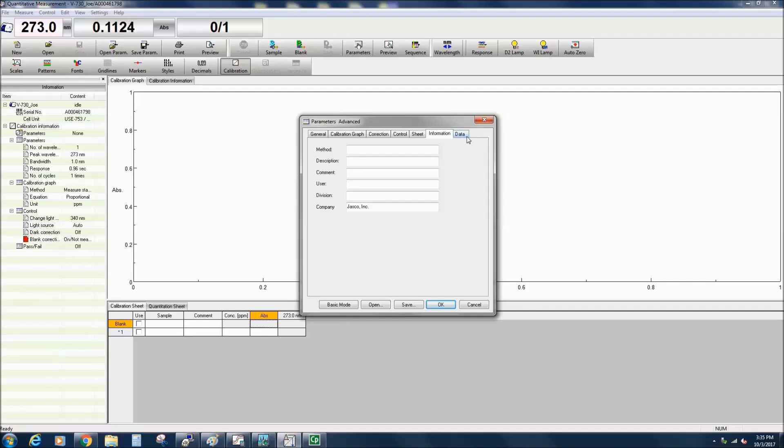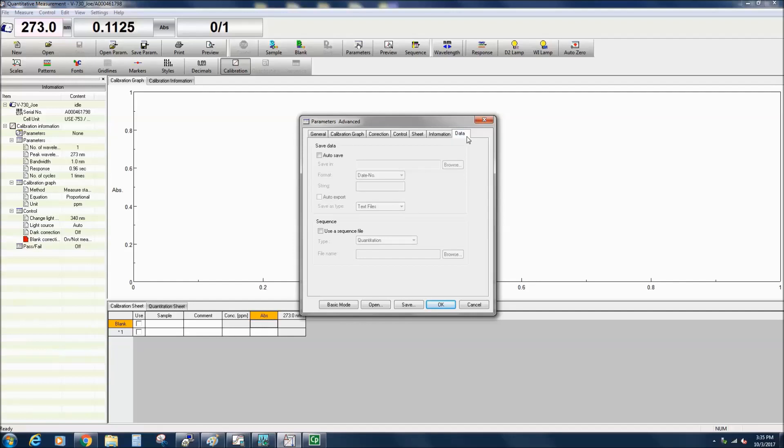The Data tab allows you to select whether to automatically save your data, as well as to specify which folder to save it to and the format the file is saved as. The data can be automatically exported as either a text or CSV file.